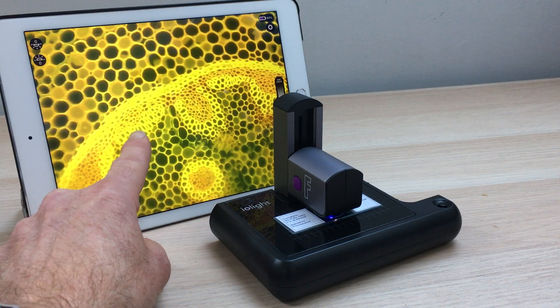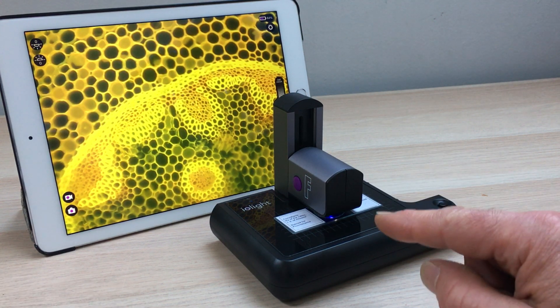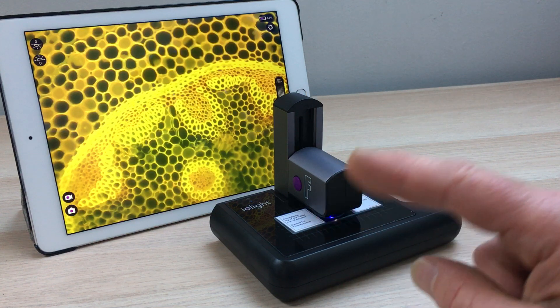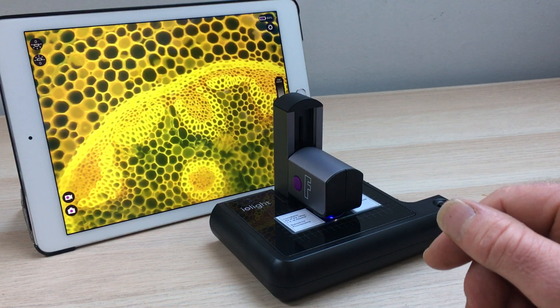You've got the green here, you've got the yellow and the red. The microscope excites at 465 nanometers and looks at all fluorescent wavelengths between 500 and 750 nanometers, so you can detect green, yellow, and red fluorescence.